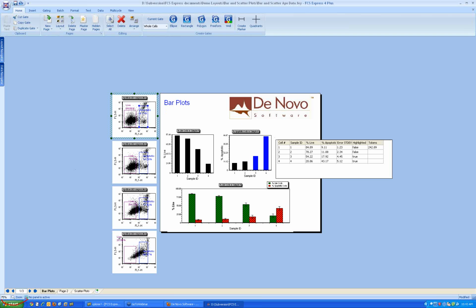Okay, how do we do this? I'm not going to get into it at all in this webinar. We do have a tutorial for it, and we will be having a webinar for it, and it's described in the manual. But essentially, the whole trick is that the new version of FCS Express allows you to build a spreadsheet. We call it a custom data, but you can think of it as a spreadsheet.